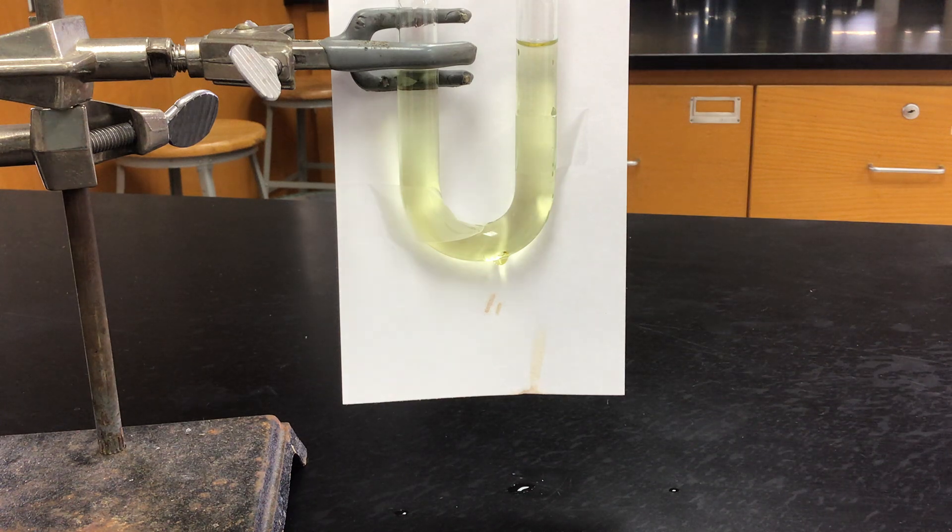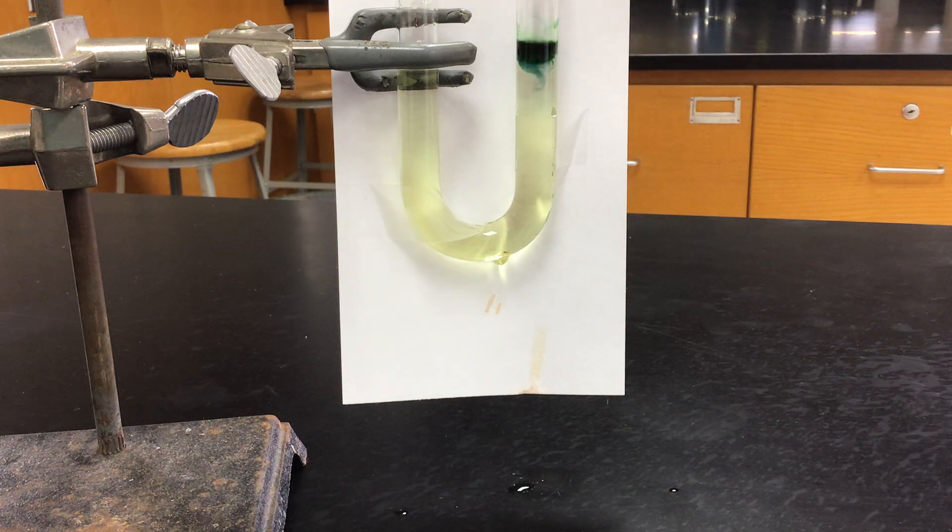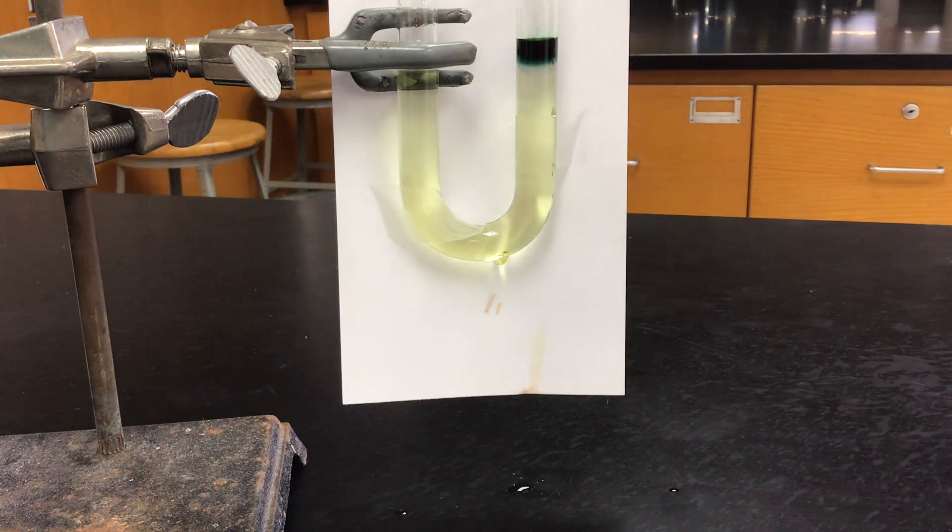So that means that the right-hand side should be forming hydroxide, and it should be basic. So what that tells me is that this should turn blue if it's basic. It definitely looks like it's turning blue to me.